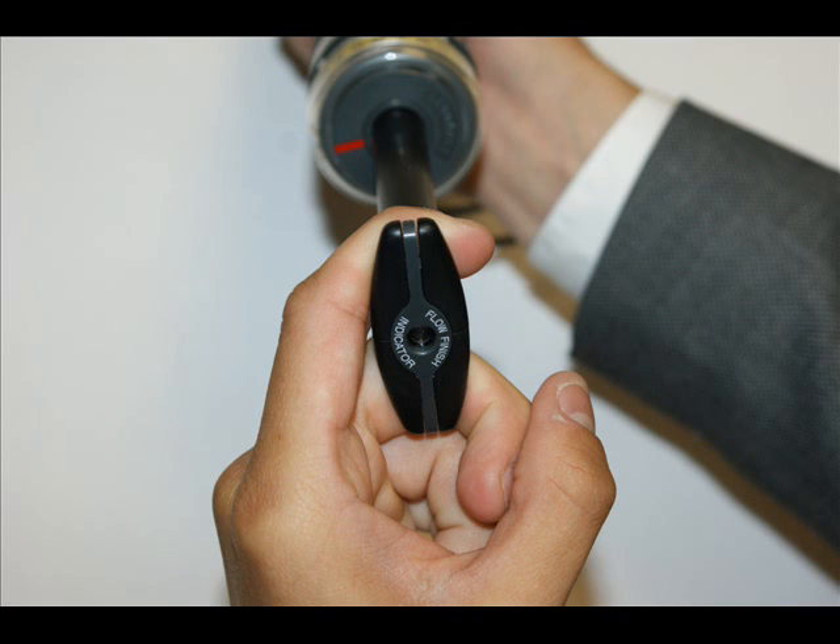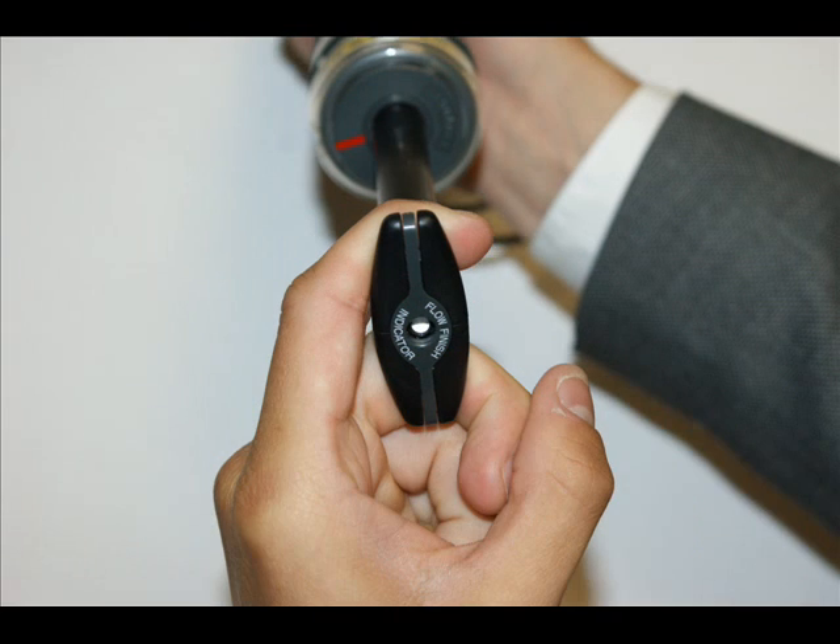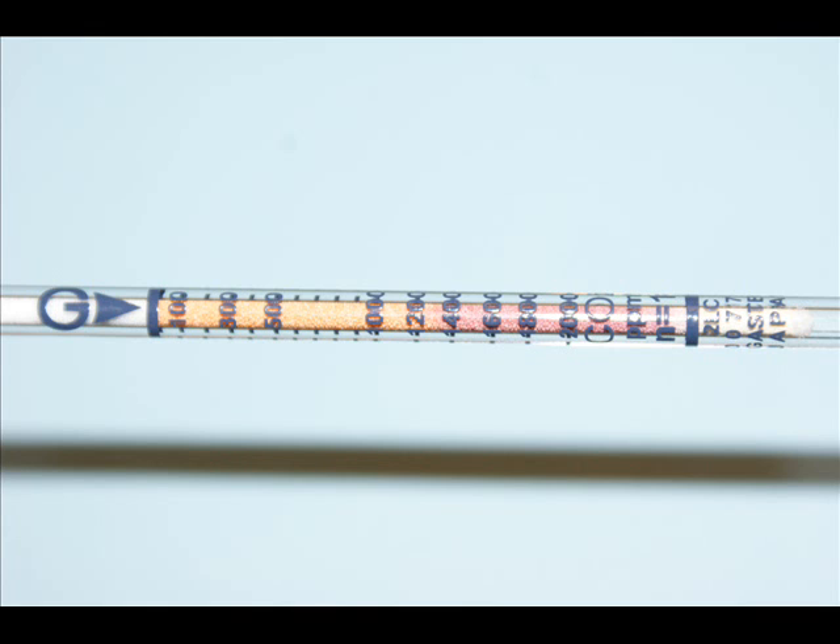The sample is finished when the flow finish indicator at the end of the handle illuminates. As the gas passes through the tube, the medium within the tube will start to change colour. When the flow finish indicator illuminates, take the reading from the scale where the colour changes. In this example, the colour changes between 1200 and 1400 ppm, therefore a concentration of 1300 ppm of CO2 can be assumed from this sample.